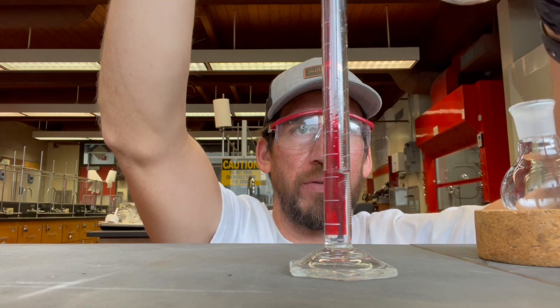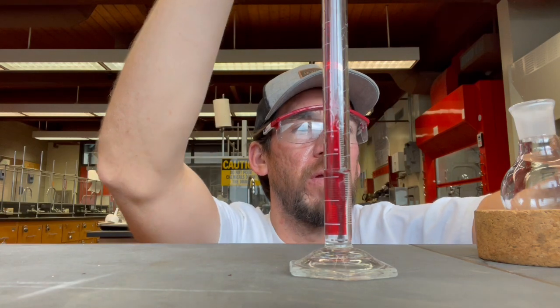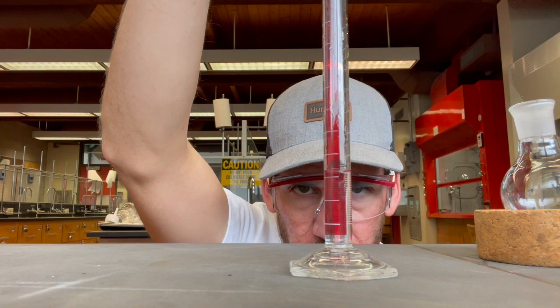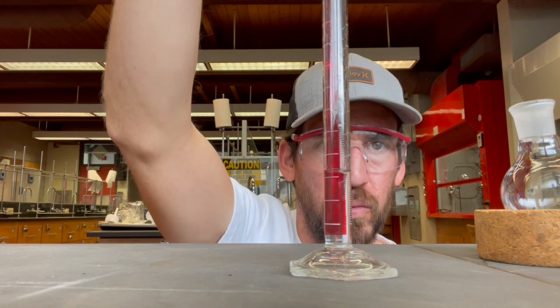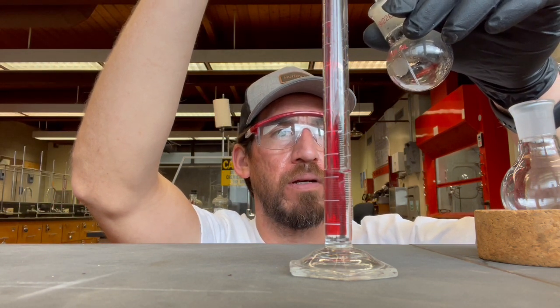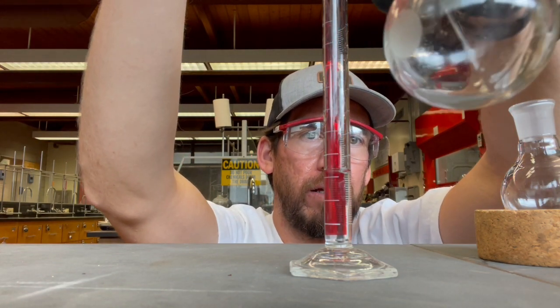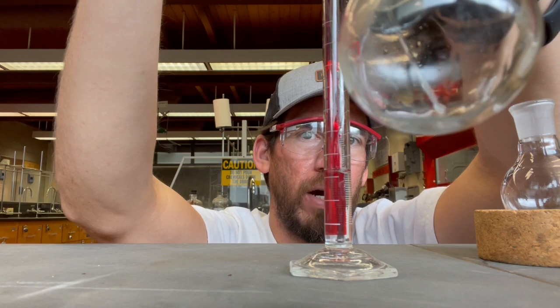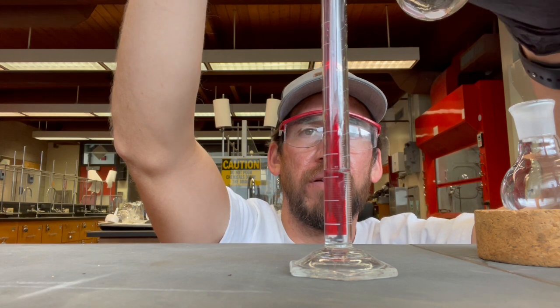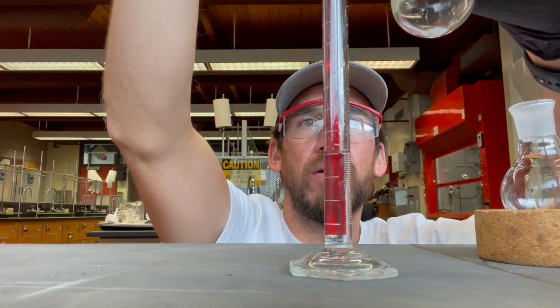This went up a little bit in here. Not worth grabbing though. This went up from 1.9 to 3.2. Okay, 3.2 for that one. You can see how the liquid in here is definitely not water, or not pure water. You can just see the way it's rolling around. So 3.2 all the way up to 4.